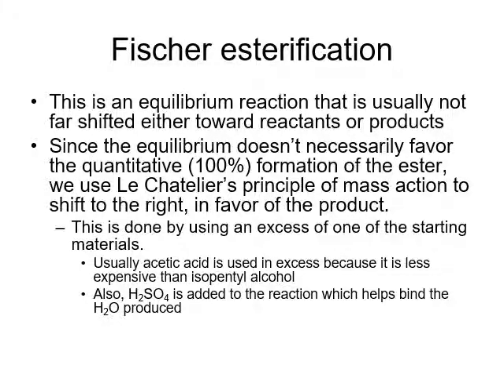The reaction that we'll be conducting is called the Fischer esterification. It's an equilibrium reaction, and it's usually not far shifted either toward reactants or products. So since it doesn't favor the quantitative 100% formation of the ester, we use Le Chatelier's principle from General Chem to shift to the right in favor of the product, and we do that through adding an excess of acetic acid, which is the cheaper reagent. We also use sulfuric acid, H2SO4, which helps bind the H2O produced.